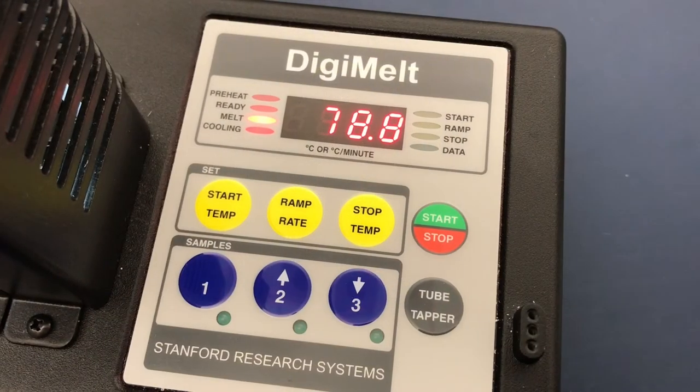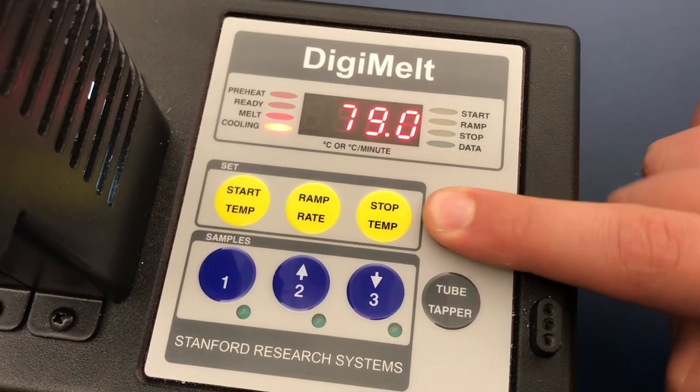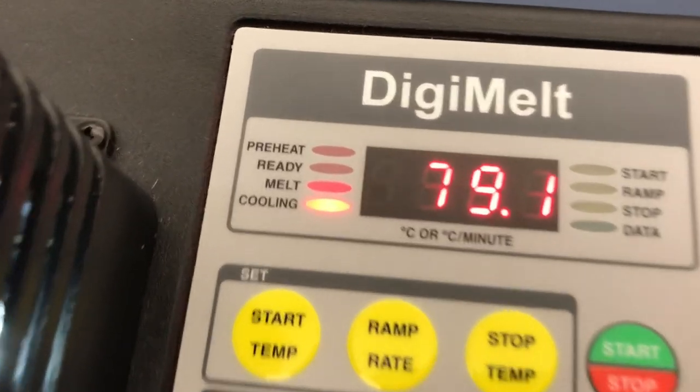To turn off the DigiMelt, press stop and allow it to cool. Then press the switch behind the DigiMelt.